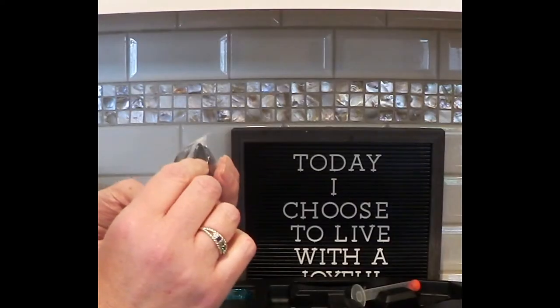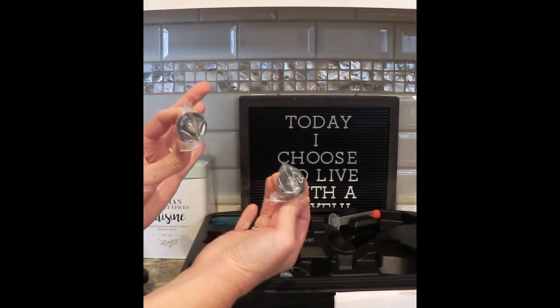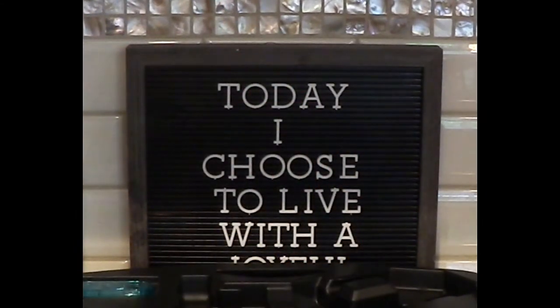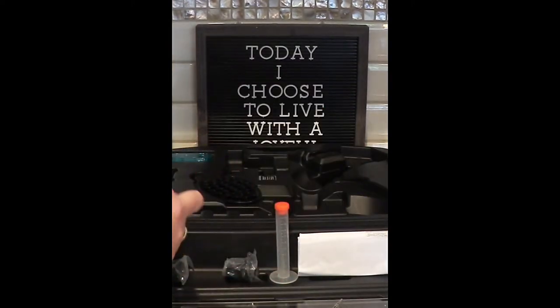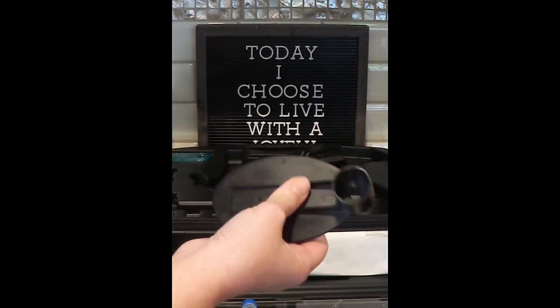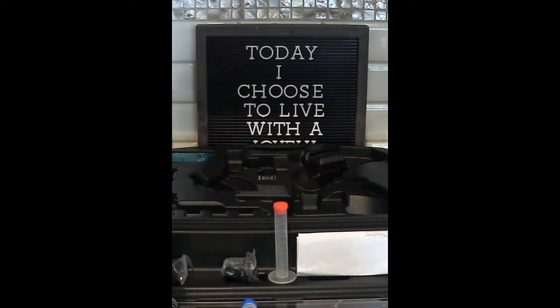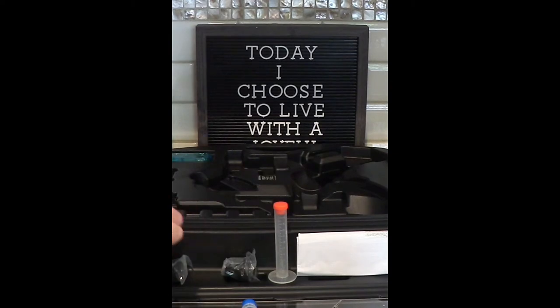Tweezers. These are different on-pieces — maybe they're a higher magnification. We've got that. A graduated cylinder. And then we have a pipette. These are empty but I guess you fill them up with your solutions. This would just suction. I think this goes on the bottom. I'm not sure what this is for really — it might hold something. It looks like it might hold the slide. I'll find out.